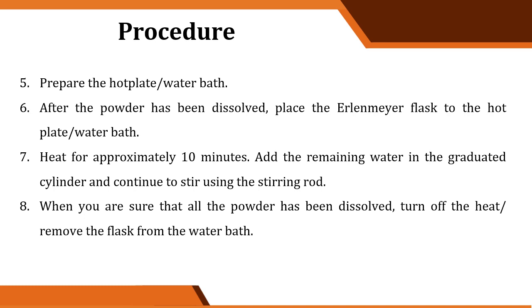Kasi minsan kapag bigla siyang kumukulo, tumatapon siya sa flask. So, yun yung babantayan natin. So, habang hinahalo, monitor the temperature, tingnan kung kukulo na siya. And then kapag yan naaamba na, ialis agad sa heat kapag aapaw siya sa flask. Okay? Di ba ganoon naman magluto ng gelatin?